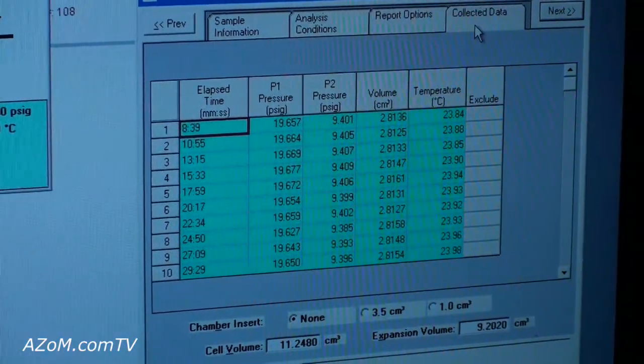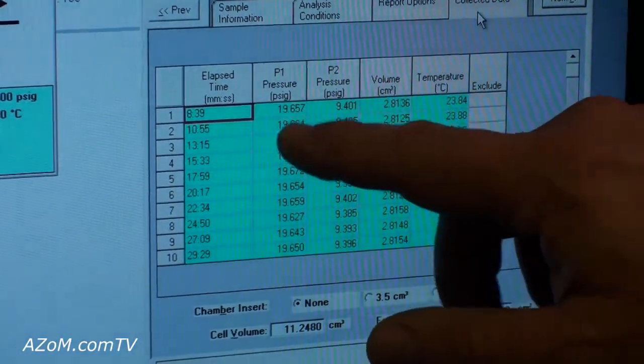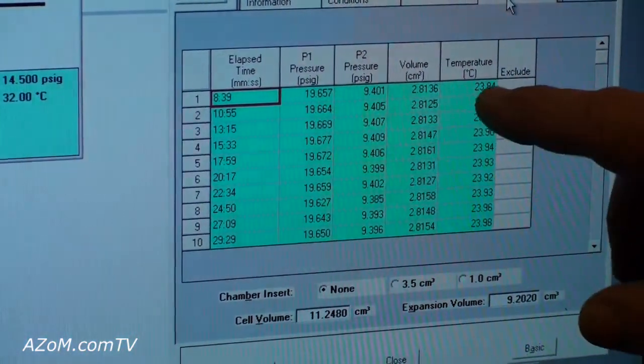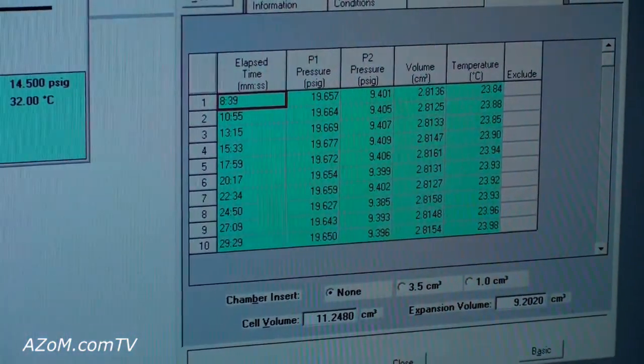And here is an example of the raw collected data where we have stored the different pressure cycles, the volume that we have calculated displaced by the sample and the temperatures of those analyses.